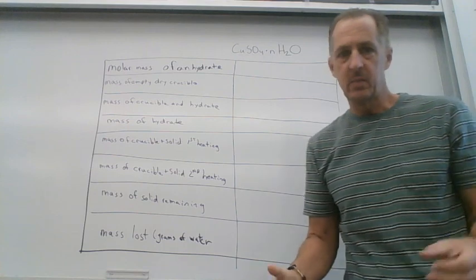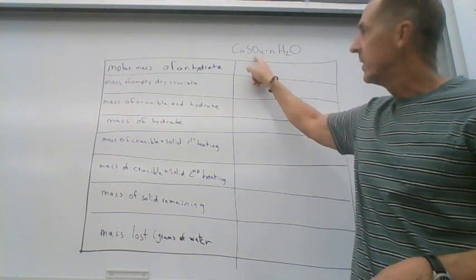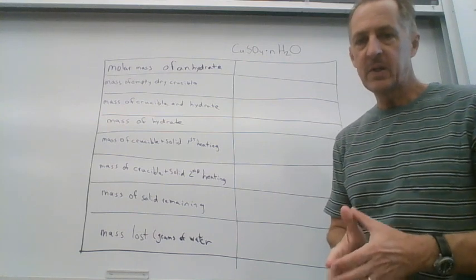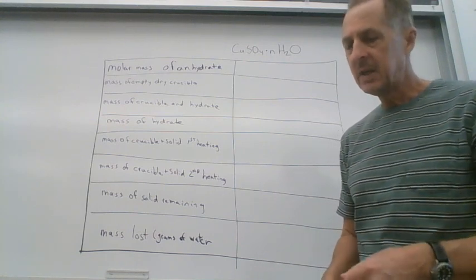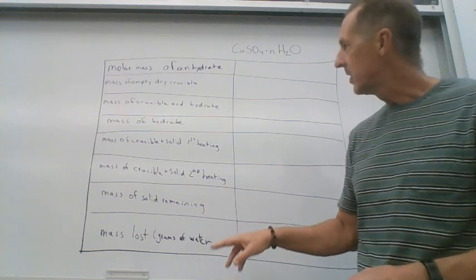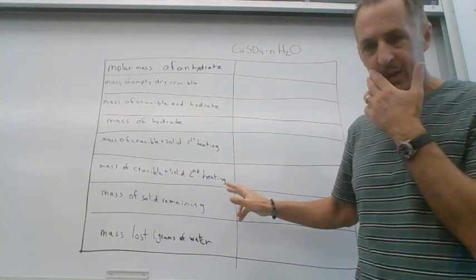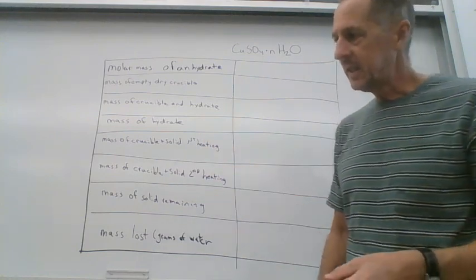is the unknown number. So what we're trying to do in this lab is figure out how many moles of water are attached to the copper sulfate to figure out the degree of hydration. And first we're going to look at the experimental setup, and then we'll go over some of the calculations. This data should already be in Canvas, but I'll show you how we're going to collect the data as we move along.